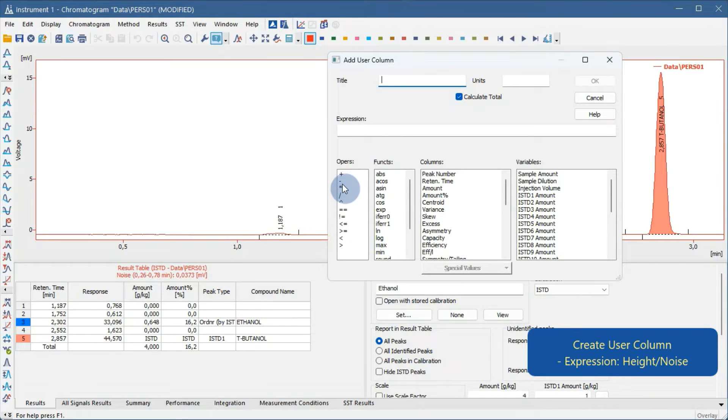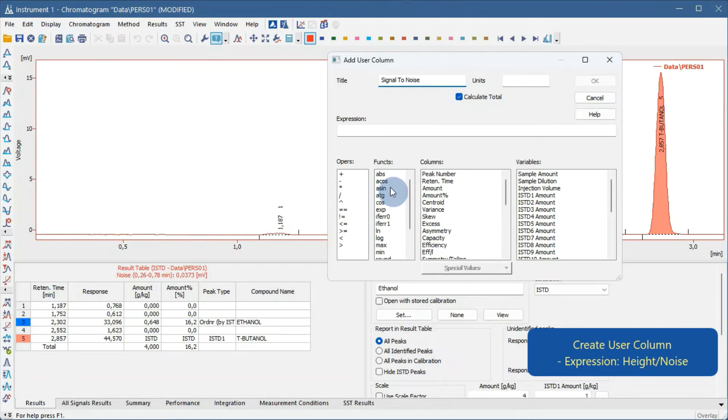Fill in the name. Fill in the expression, Height Column divided by Noise variable determined beforehand.